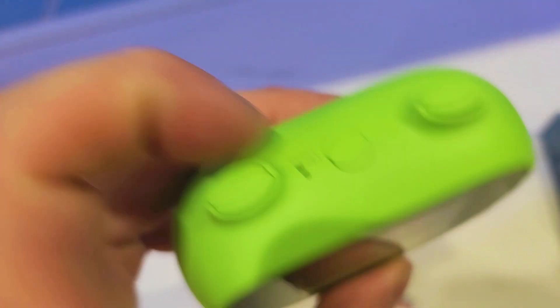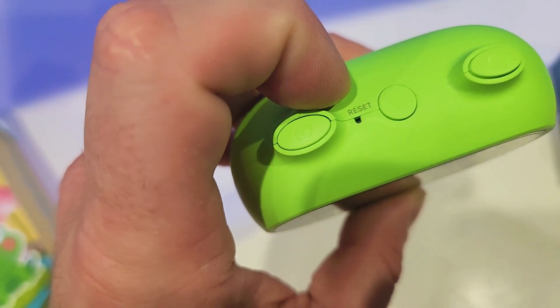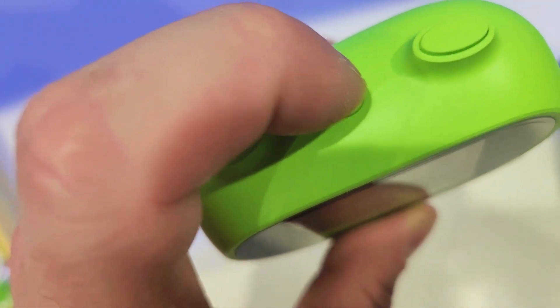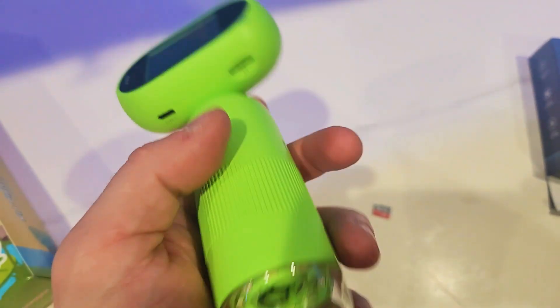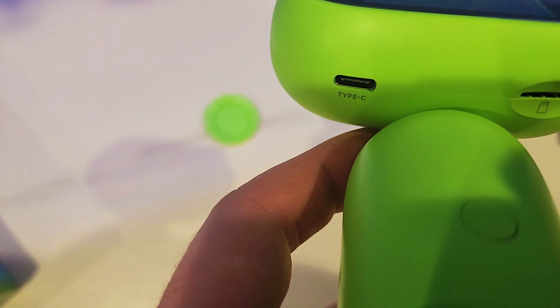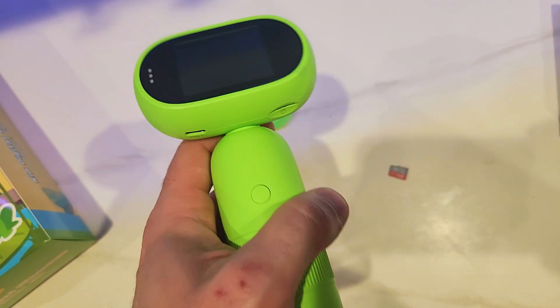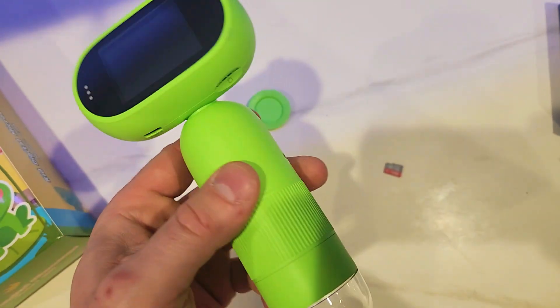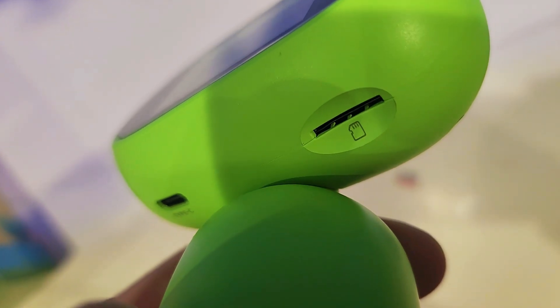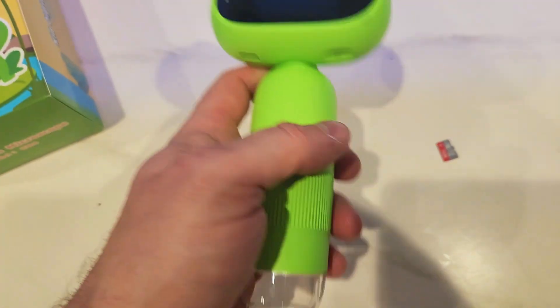At the very top you have your reset button. So if the microscope is giving you issues, just put a pin in here and hold it for about 5-10 seconds and it will reset all the settings. This is your menu key, so you can navigate the different video and photo menu options. This is the left key and this is the right key — this is how you navigate between playback. At the very bottom you have your USB-C charging port; it comes with a cable. It takes about 2-3 hours for a full charge and lasts about 4-5 hours of playtime. The SD card slot is here, though they did not provide a card. It's pretty light and slim.